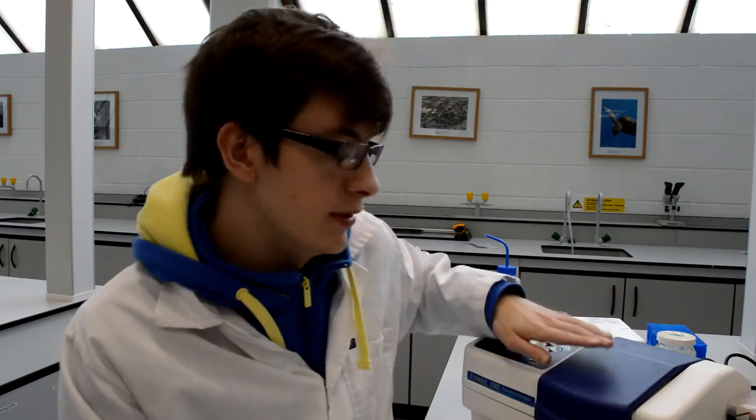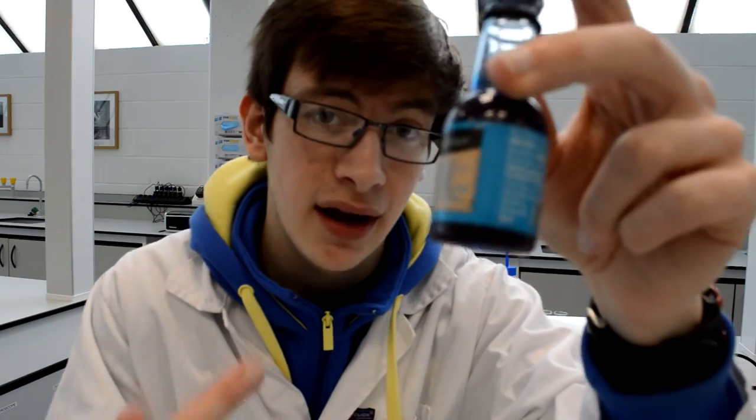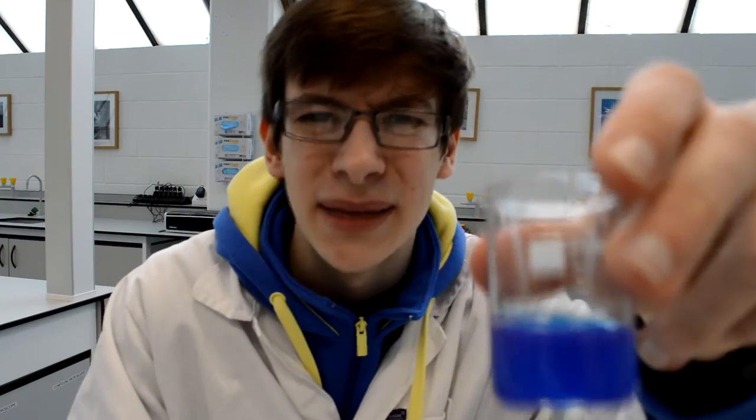The final major piece of equipment I'm going to teach you about is the spectrophotometer. This bad boy right here. A spectrophotometer measures the amount of light that a solution is absorbing. An easier way to explain absorbance is that this solution of food coloring right here has a really high absorbance because you can barely see through it and it's absorbing a lot of light. Whereas this solution that I made earlier has a lower absorbance because you can see through it slightly more. If that makes any sense.